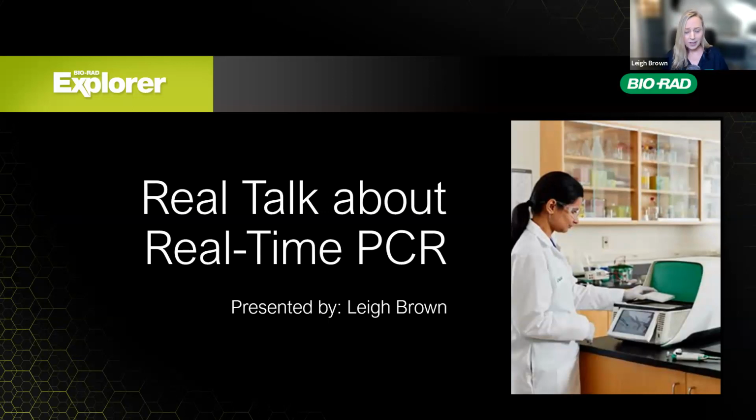So today we're going to be talking about real-time PCR. We'll also talk a little bit about conventional PCR and some experiments that students are doing around the country that you might be able to bring into your own classroom, whether you're doing them as a lab or you're just talking about them with your students and generating ideas and things like that.